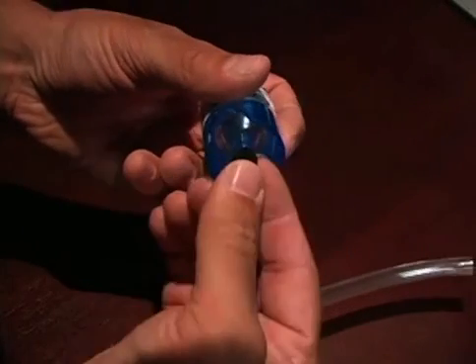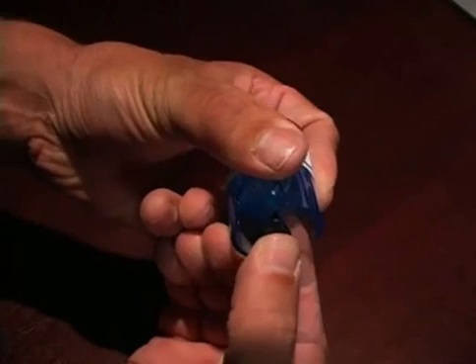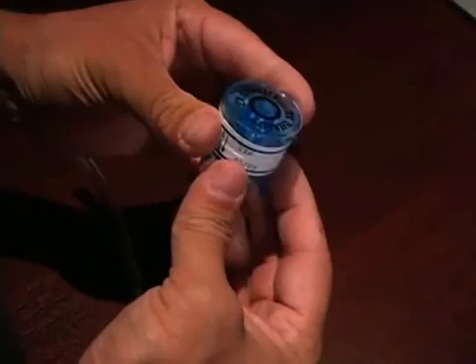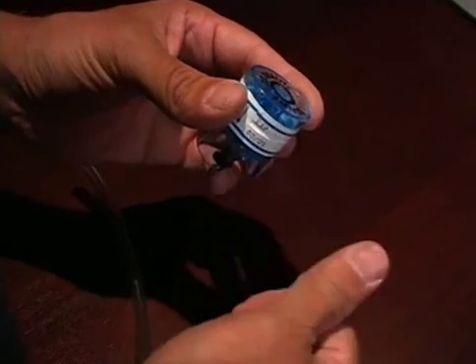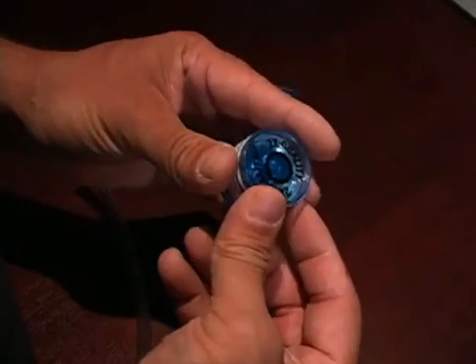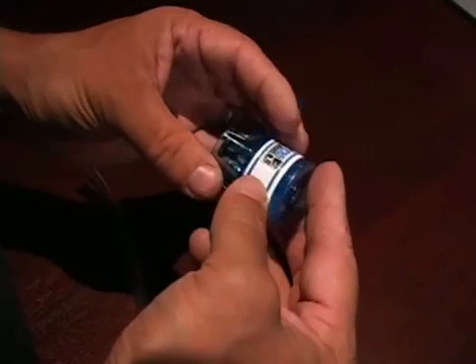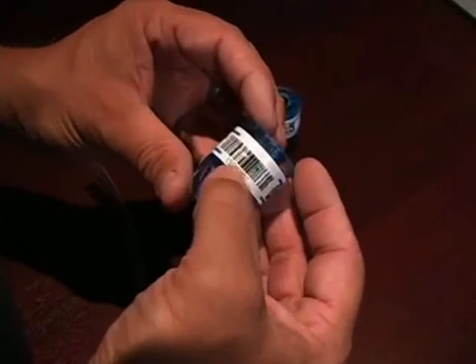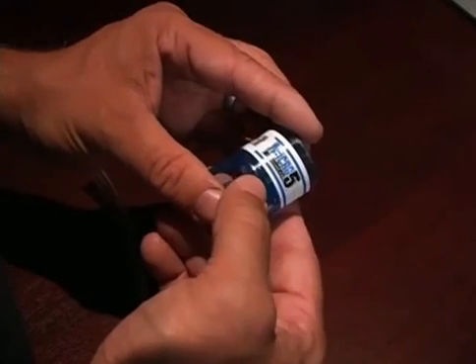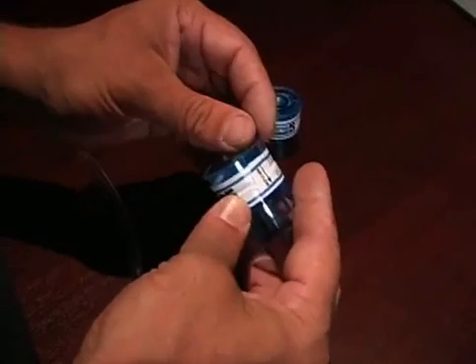And then you record your field notes in your work ledger book, log book, and in the chain of custody. And the notes would include any serial numbers, any expiration dates, time, location, the number of minutes, calibration, and then send the microcassette to the laboratory for analysis.